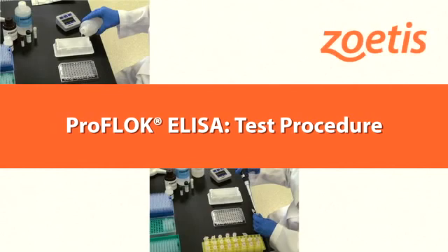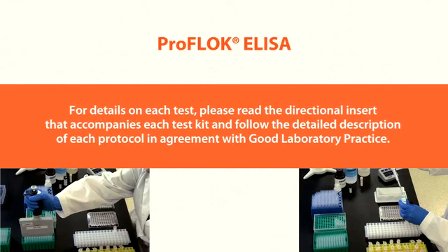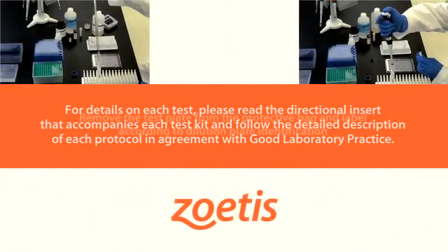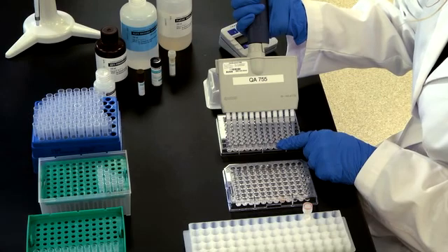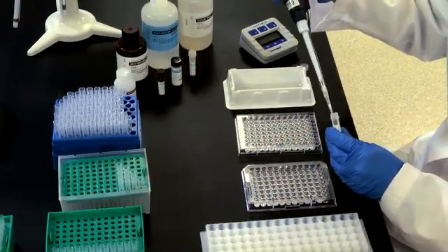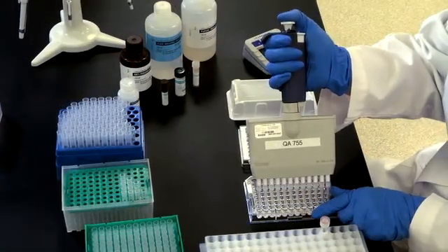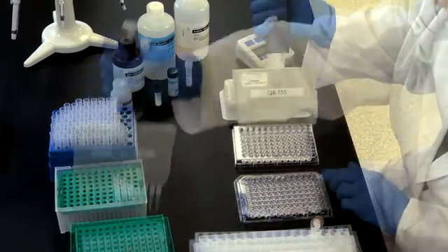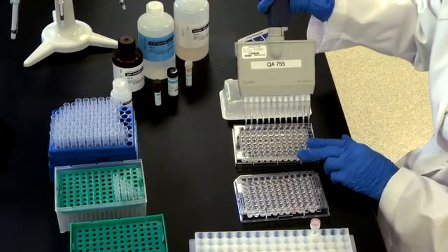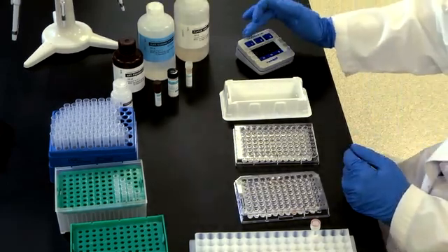These are general instructions for performing ProFlock ELISA tests. There are slight variations in procedures and interpretation across the different test kits; please read the directional insert for details. Remove the test plate from the protective bag and label according to dilution plate identification. Add 50 microliters of dilution buffer to all wells on the test plate. Add 50 microliters of diluted positive control serum to wells A1, A3, and H11. Discard the pipette tip. Using an 8- or 12-channel pipette, transfer 50 microliters per well of each diluted serum and normal control from the dilution plate to the corresponding wells of the coated test plate, yielding a 1 to 100 dilution. Discard pipette tips after each row. Transfer samples as quickly as possible. Incubate for 30 minutes at room temperature.